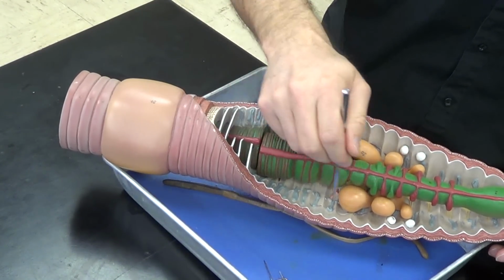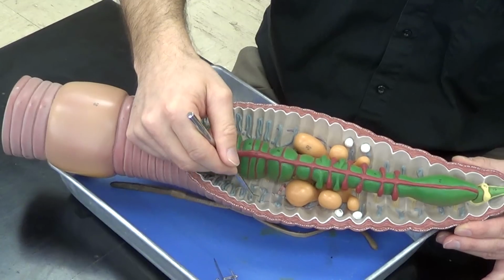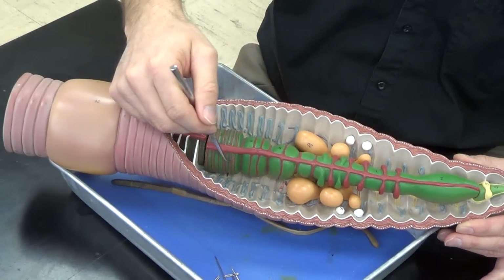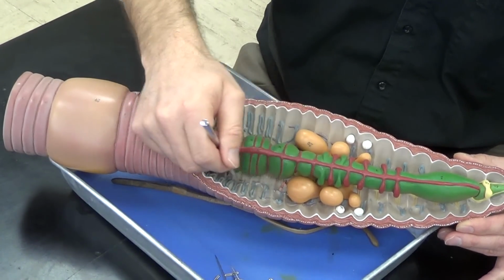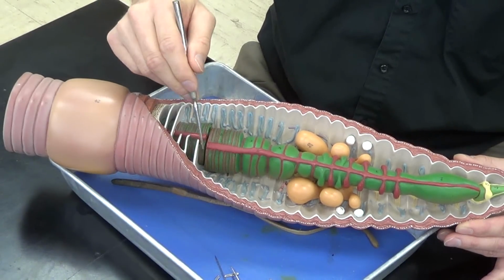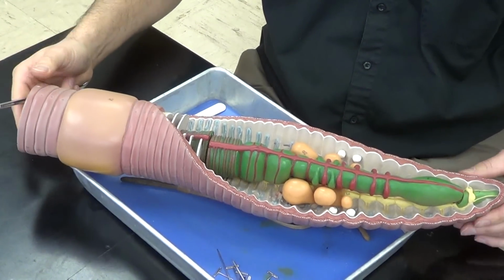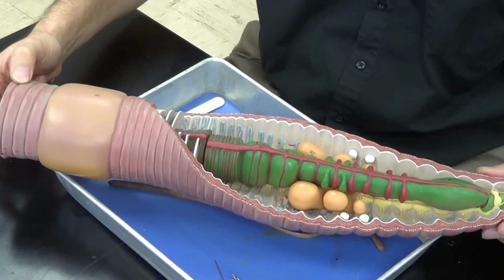Now, the actual compartment here, all this space between the wall of the earthworm and the intestine, or the digestive tract of the earthworm, is referred to as the coelom. And the coelom is broken up into segments by these septa. All right, let's go ahead and actually start the earthworm dissection.